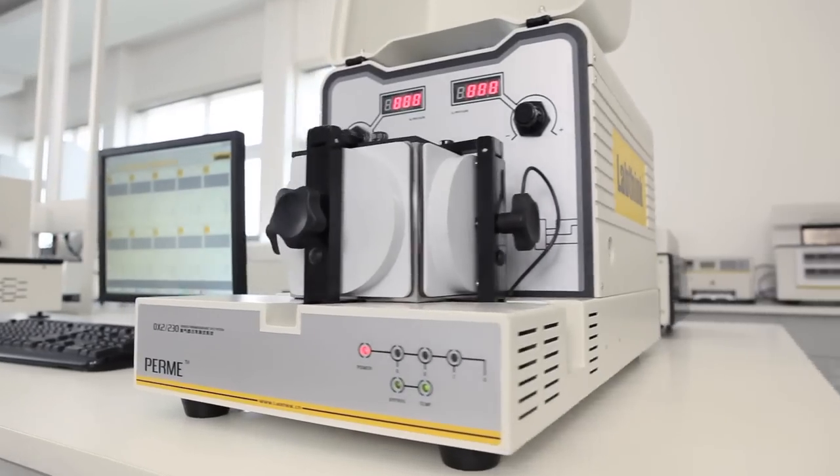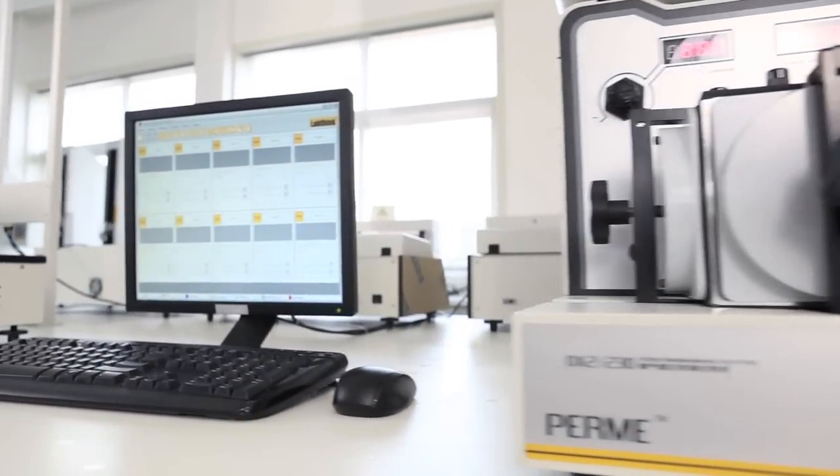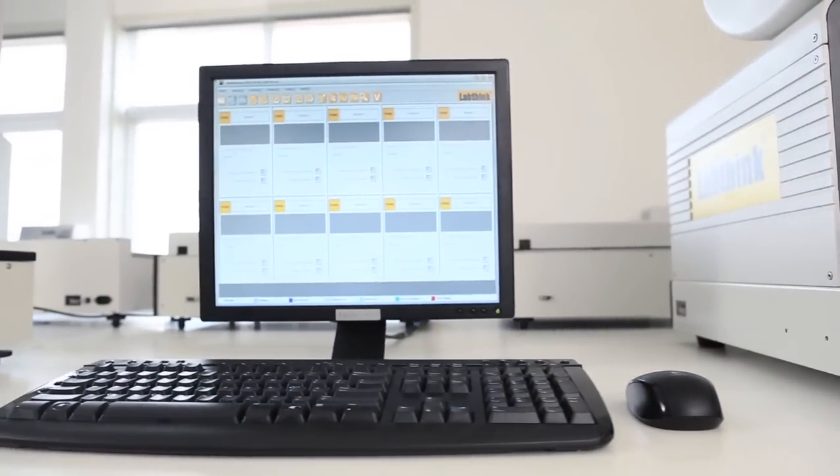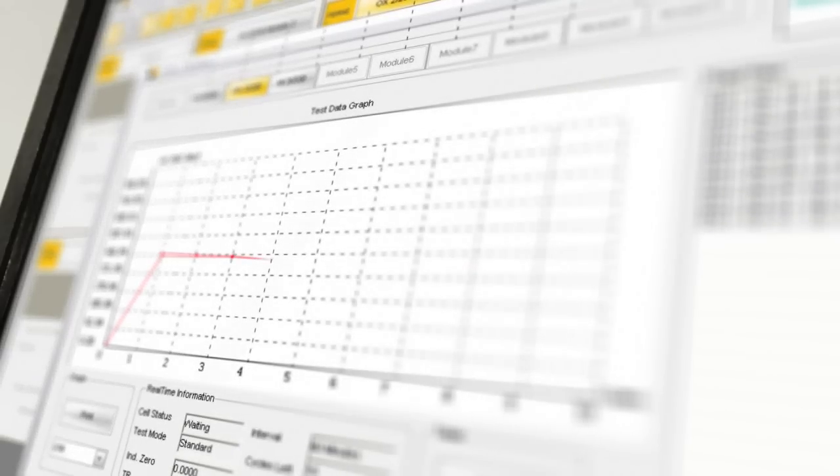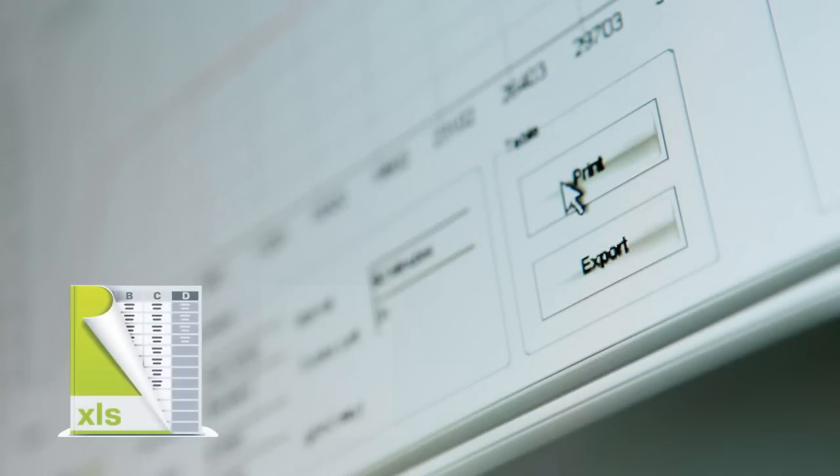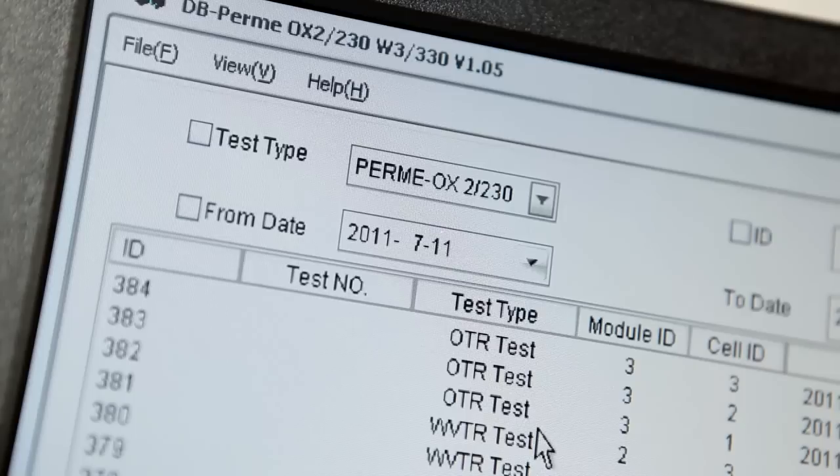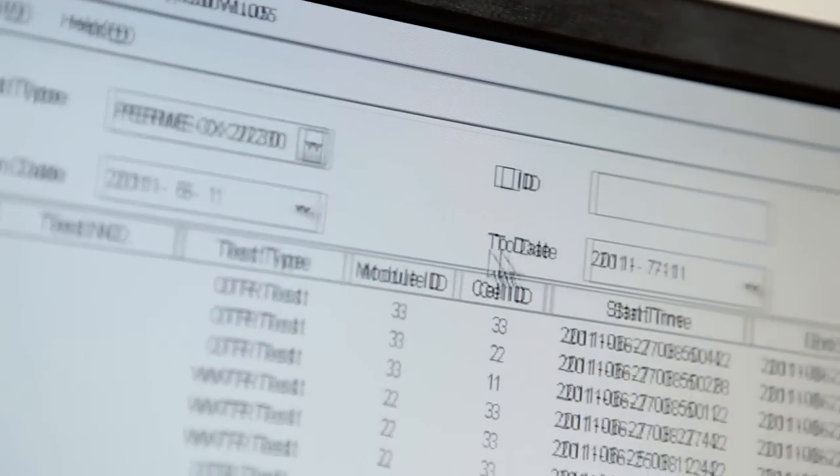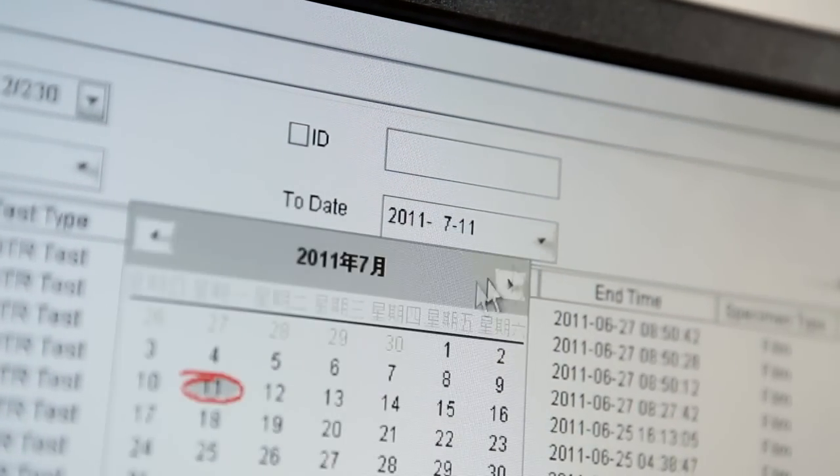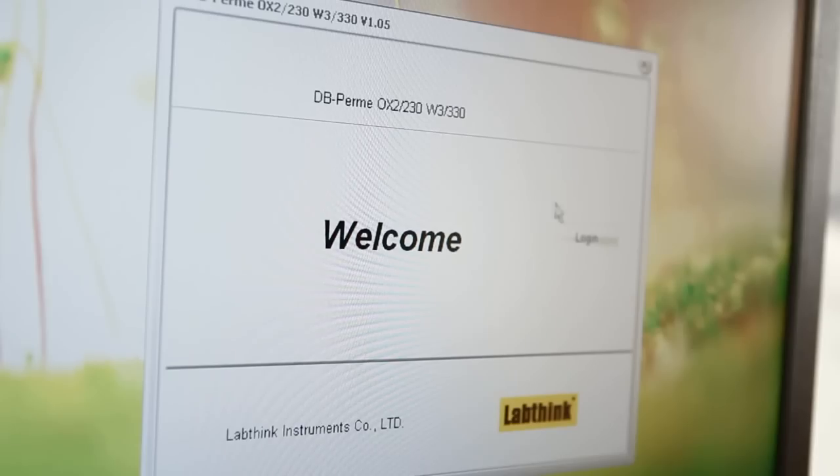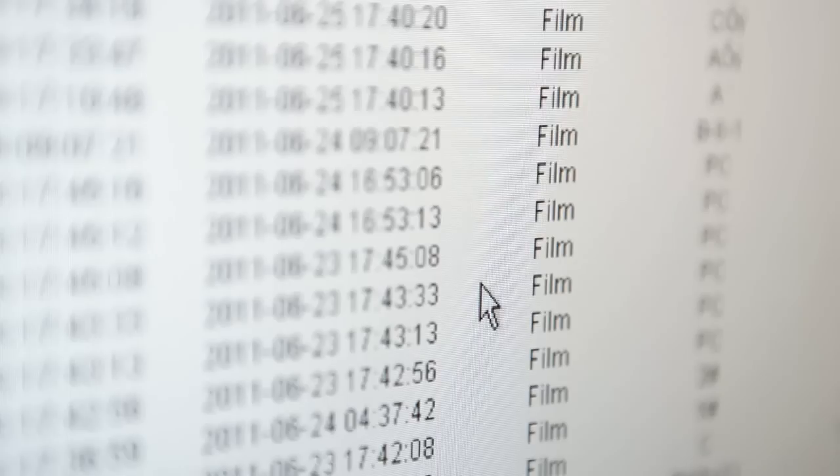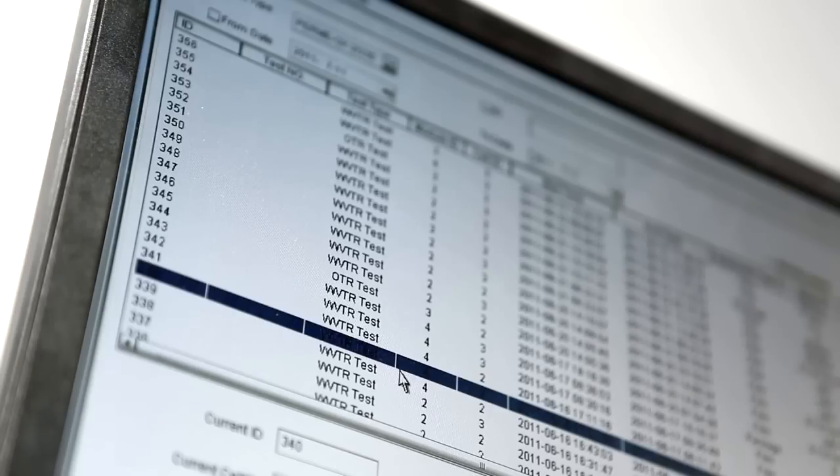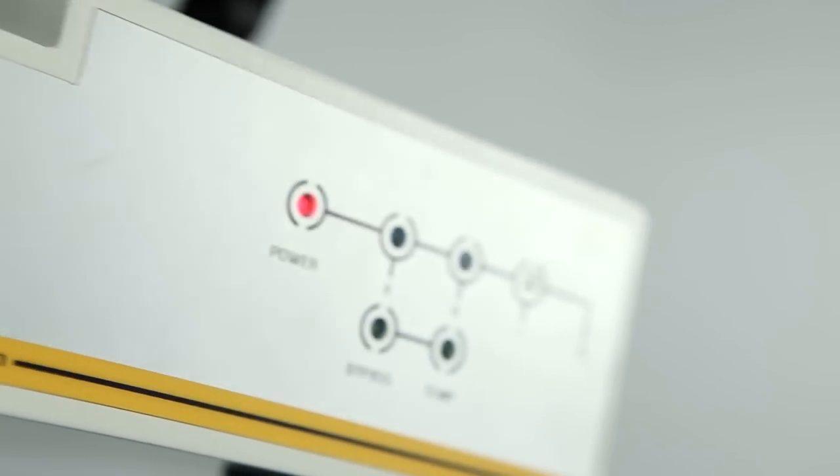The testing software specifically designed by LabThink has a user-friendly operation interface and visual display of real-time data and graph data that can be saved in Excel format and database format. It can carry out historical data search and comparison and reanalysis of raw data. This software can also operate and monitor the WVTR testing system and the OTR testing system at the same time.